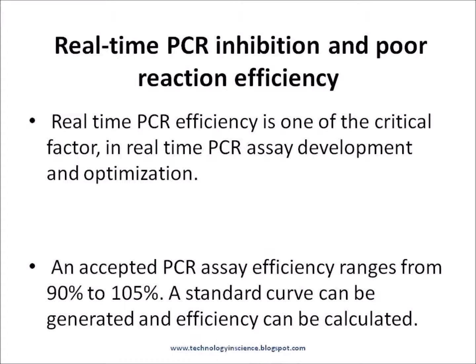Parameters to optimize include buffer composition and other reaction conditions. An accepted PCR assay efficiency ranges from 90% to 105%. A standard curve can be generated and efficiency can be calculated from it.